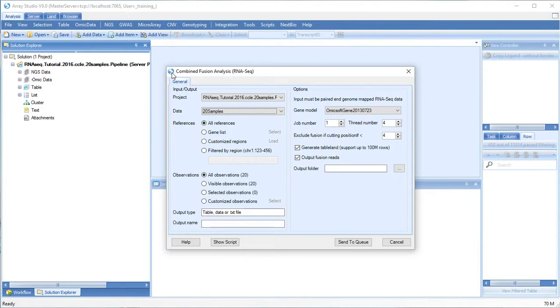The combined fusion analysis module expects paired-end genome mapped RNA-seq reads but you can still run the fusion map module with DNA-seq or single-end reads.